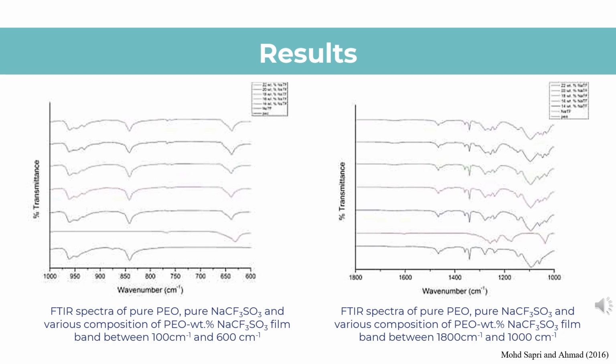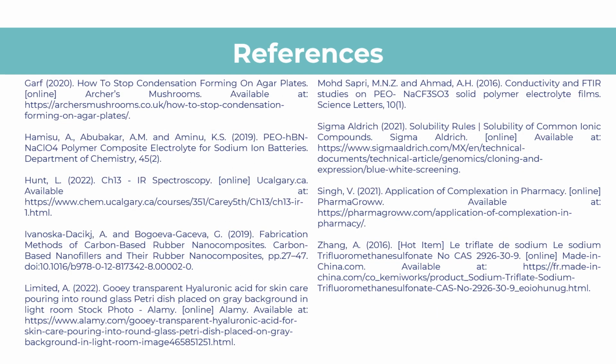The presence of new bands and changes in the shape, position and intensity of the peaks confirm the complexation of PEO and NaCF3SO3. There were references that were used.